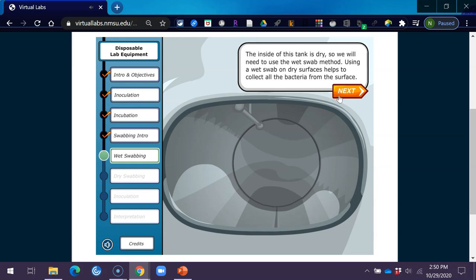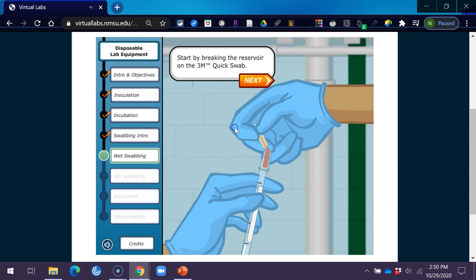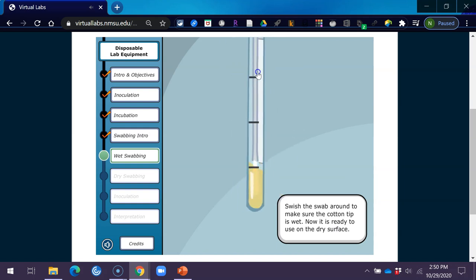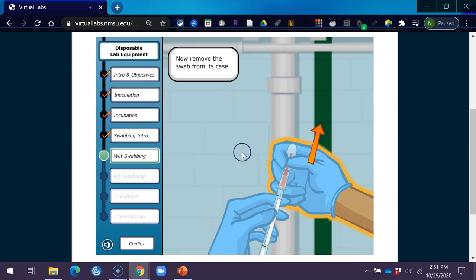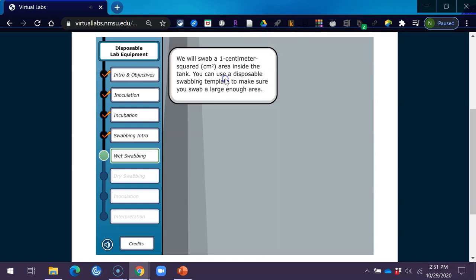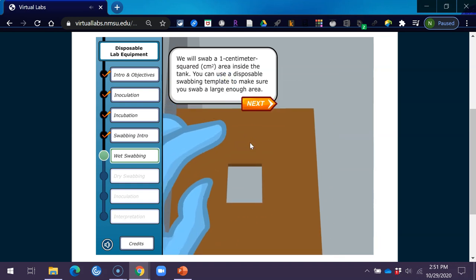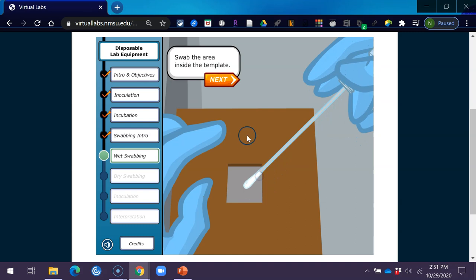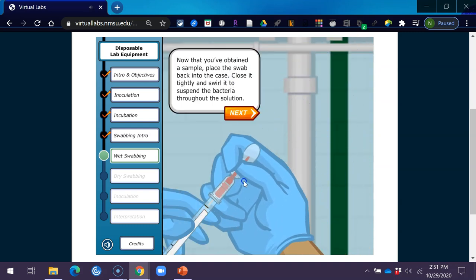The inside of this tank is dry, so we will need to use the wet swab method. Using a wet swab on dry surfaces helps to collect all the bacteria from the surface. Start by breaking the reservoir on the 3M quick swab — the fluid in the reservoir will fill the bottom of the tube. Swish the swab around to make sure the cotton tip is wet. Now remove the swab from its case and swab a 1 cm squared area inside the tank. You can use a disposable swabbing template to make sure you swab a large enough area.